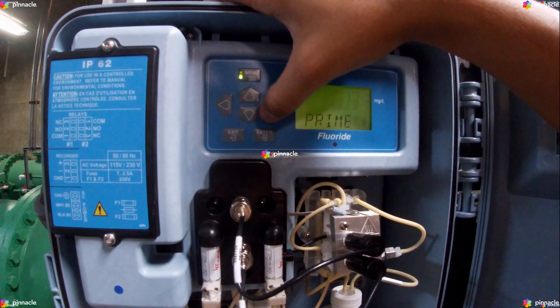The Prime option gives you several options for priming different parts of the system, including the sample, standard one, standard two, and all.